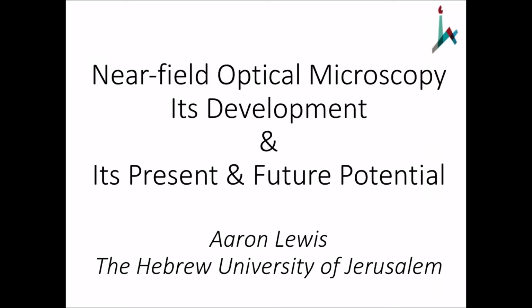The goal of this talk is to give you an overview of microscopy and to place near-field optics within the constellation of types of microscopy that can be done today. And as you will see at the end of this talk, the future of microscopy is to integrate many of these techniques together in order to go beyond what you can do today in microscopy. So let's go to the first slide.